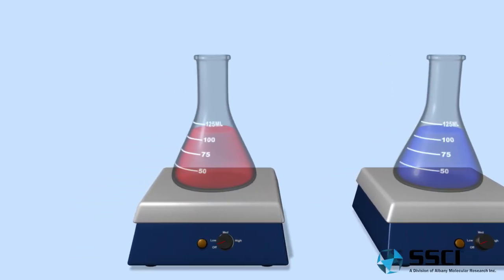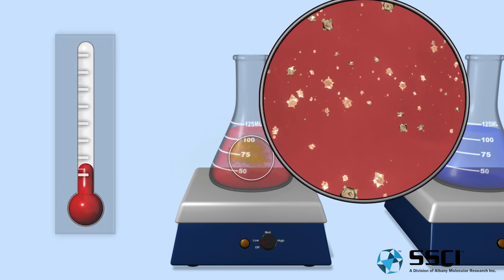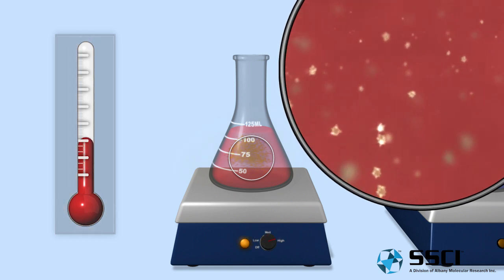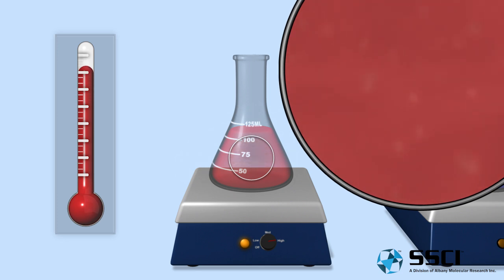This video helps visualize an example of crystallization in a polymorphic system. When a solid compound, such as acetaminophen, is added to a solvent system, heat must be applied to achieve a clear solution. This eliminates seed crystals of the starting material that could influence the outcome of the experiment.